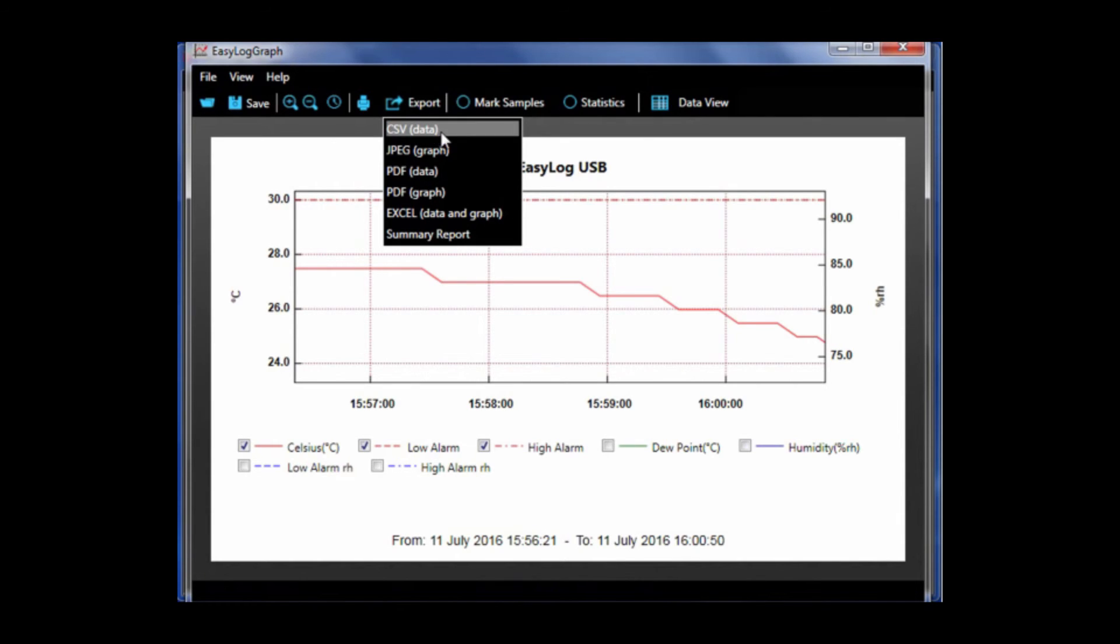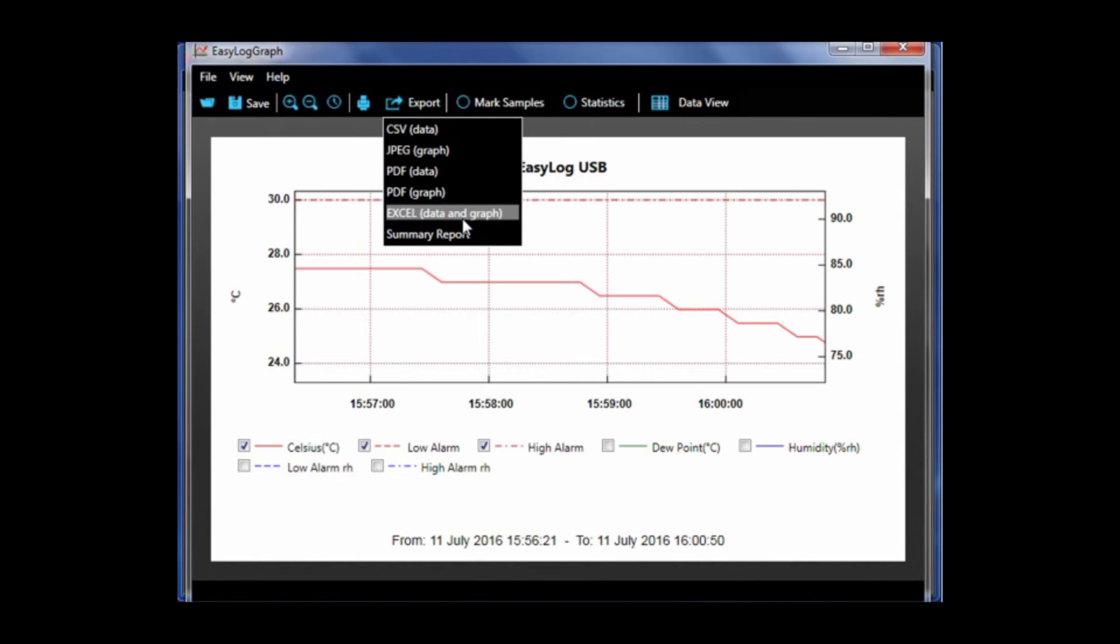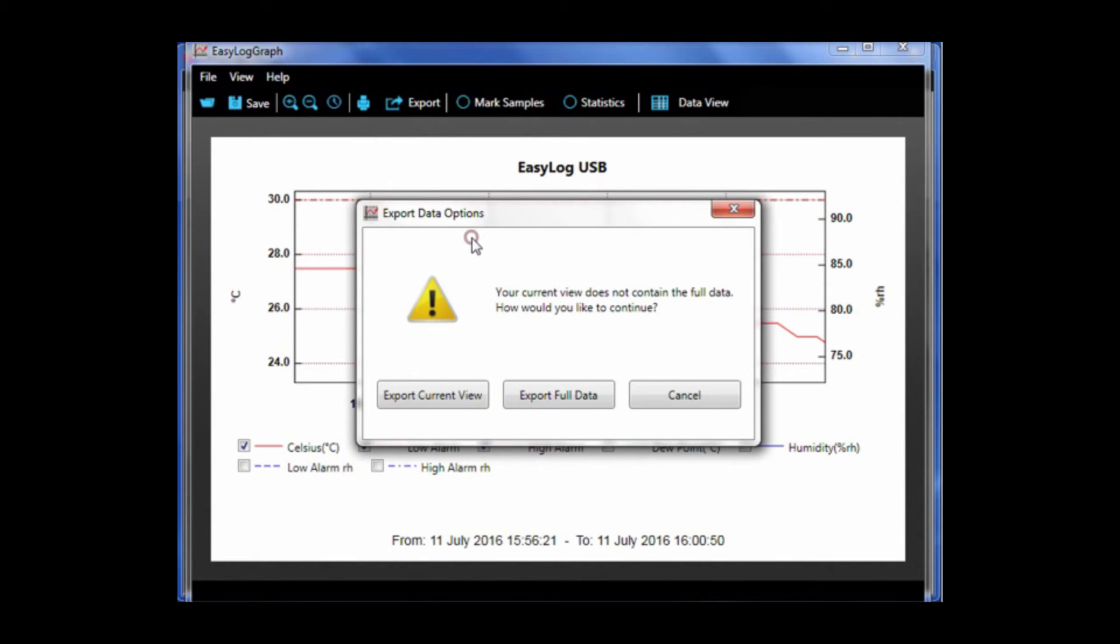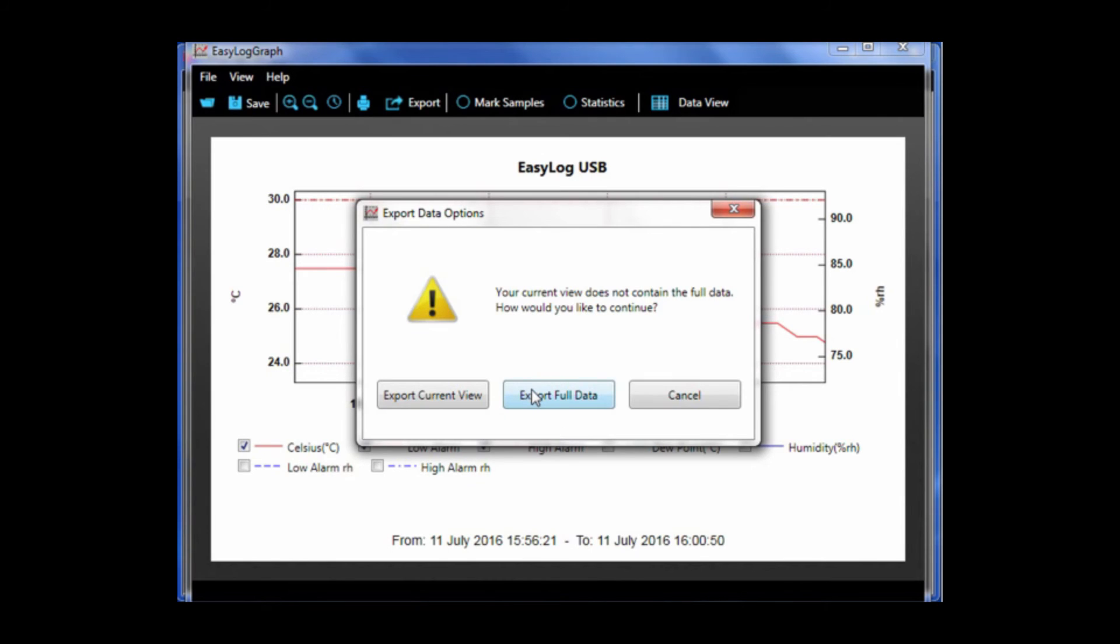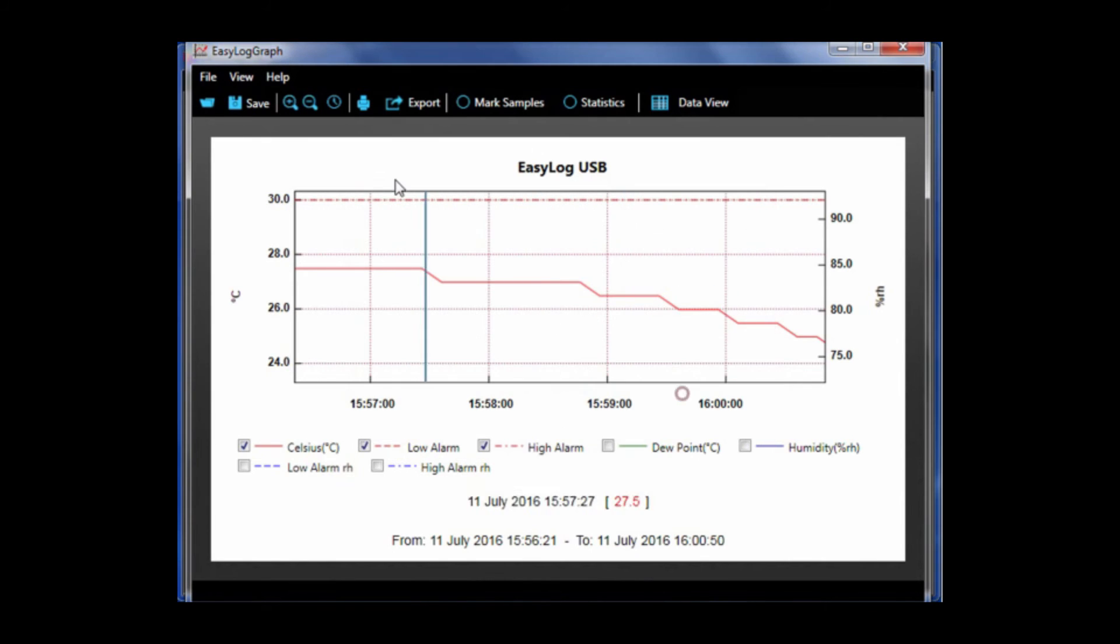To the right of that is an export option which gives you the data in a variety of formats. Click the export button, choose your desired format, and assign an appropriate file name and click save. Note that because I have zoomed in on an area, a warning message pops up giving me the option if I want to print the zoomed area or the whole graph. Take note.